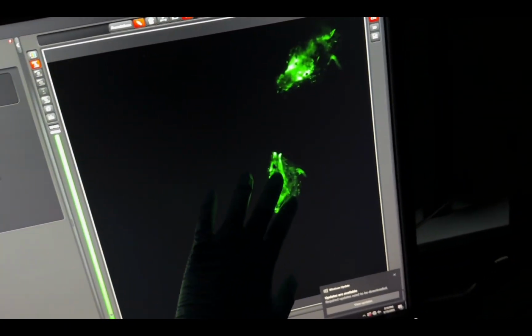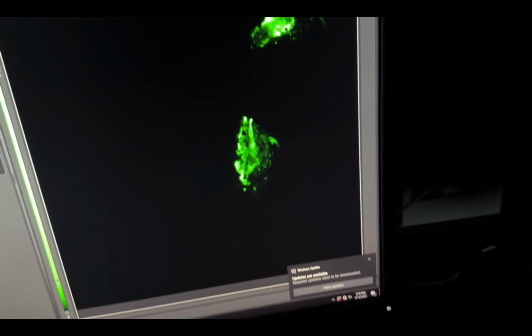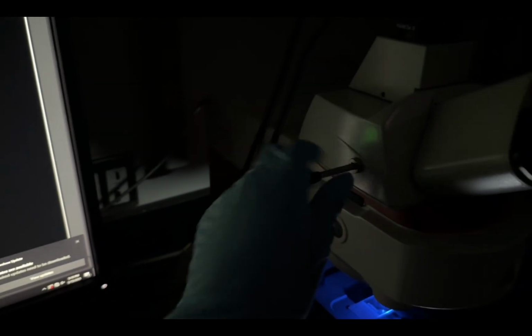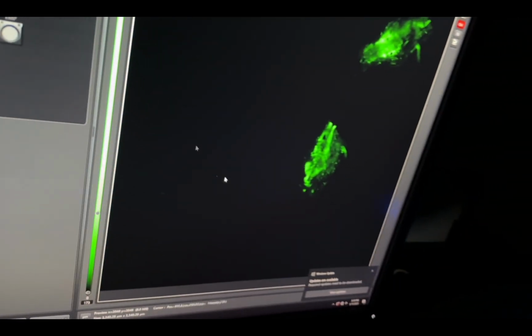Next thing you want to check is that this is in exactly the view that you want it to be in when it's imaged. And the third thing we're going to check is that this knob is pulled all the way out. Now you want to make sure the lights are off so that there's no outside light obstructing the view. And then, last but not least, you're going to click Start. Now note, you have single image, it gets one image, capture image, which means it captures it exactly as it is. But if you click Start, that's going to take your actual Z-stack.